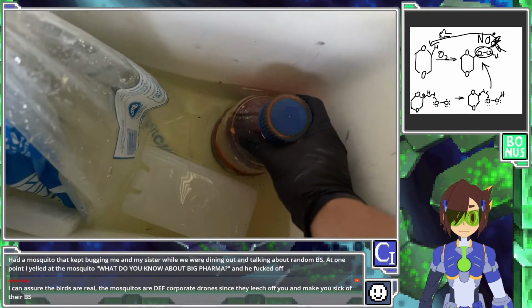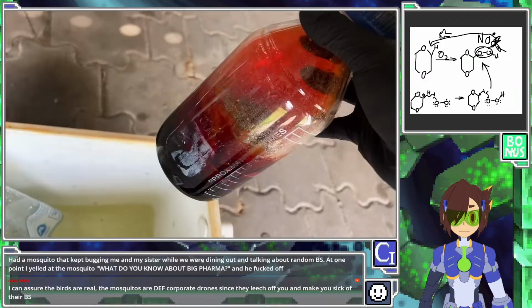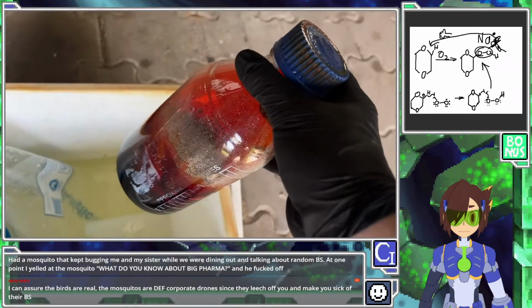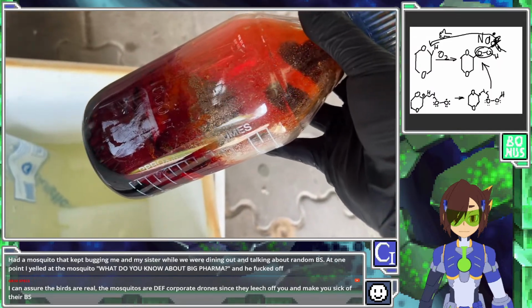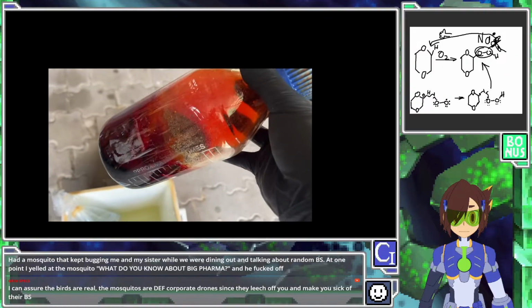That's all the bad news. The good news is, look, hey, there's still 300 mils of bromine in here, so we have actually kept most of it. Even as difficult as it is to store, we haven't leaked out a third of our bromine or anything like that. We've kept it all in the jar. It's good to go. Well, not really, not in the slightest. We've got to do some purification.